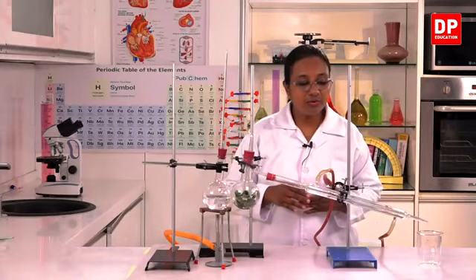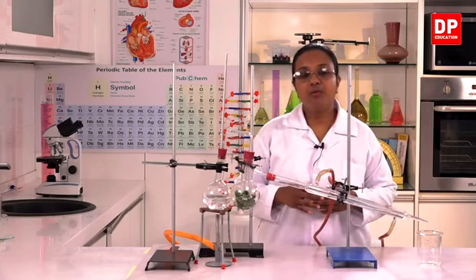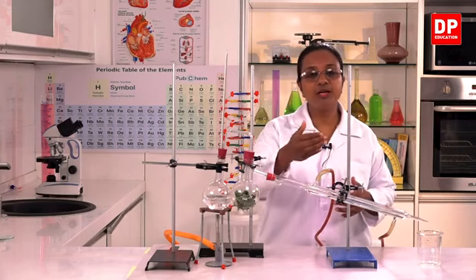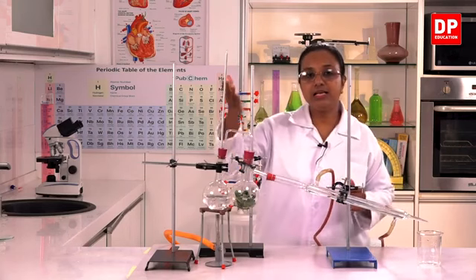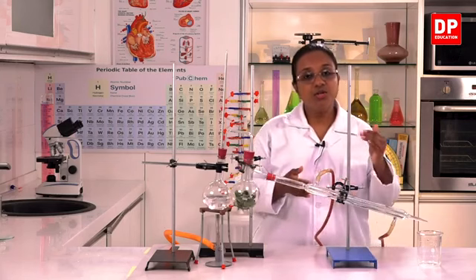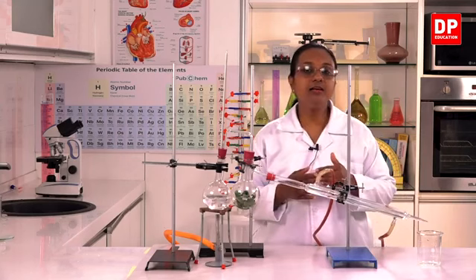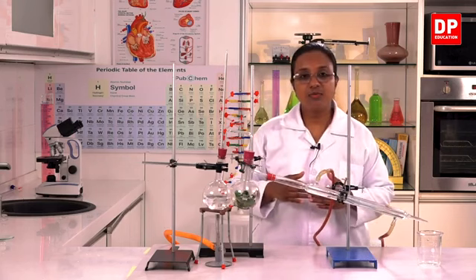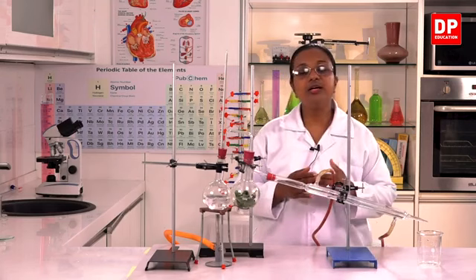As you already know, we send water through the bottom opening of the Liebig condenser and take out the water from the top opening. And you can see the condenser is kept at a slant position. There is an inclination there, so that water will enter from the bottom and fill in the condenser, and throughout the distillation process there will be water flowing continuously through the condenser.